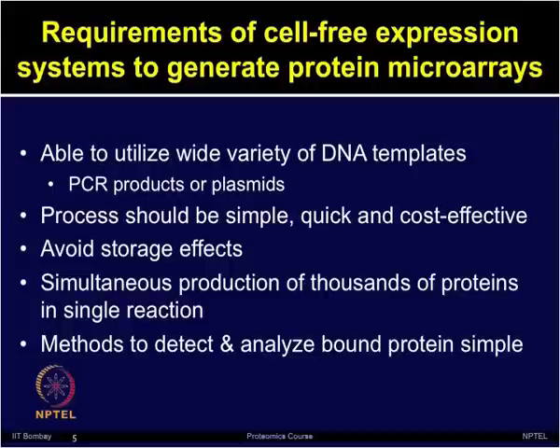The cell-free expression system should meet certain requirements, and these criteria are: first, it should be able to utilize a wide variety of DNA templates, because if you can synthesize proteins from a variety of DNA templates, whether plasmid or PCR products, then it gives a more versatile platform.